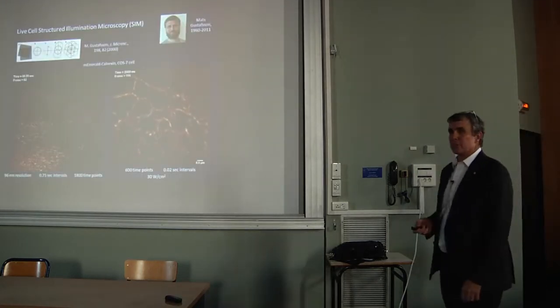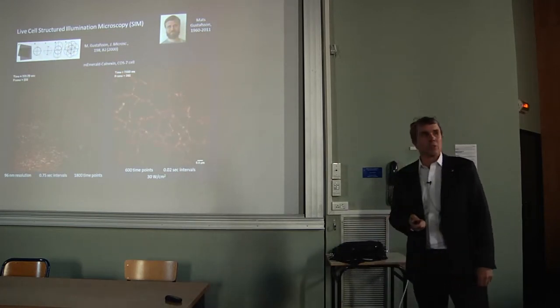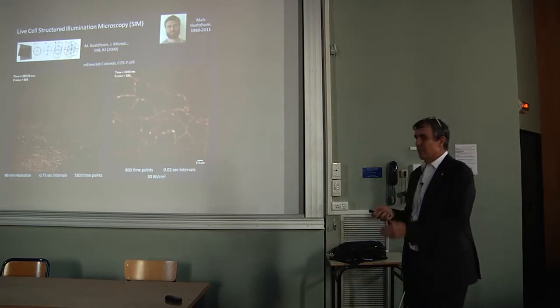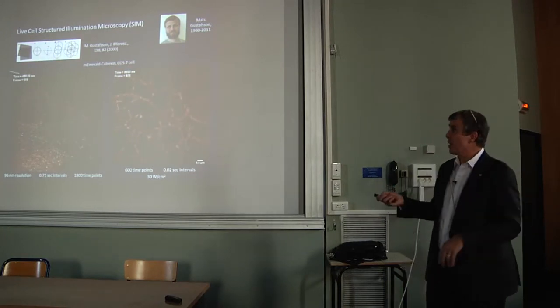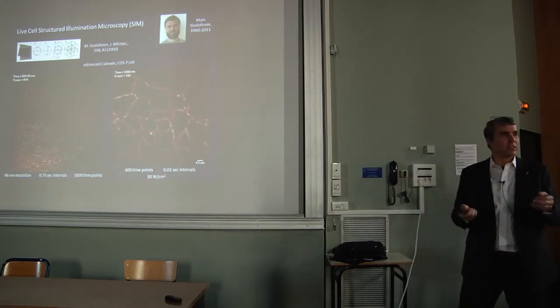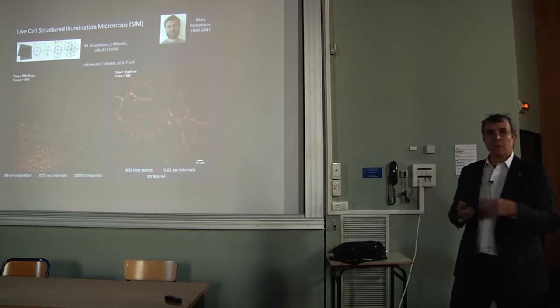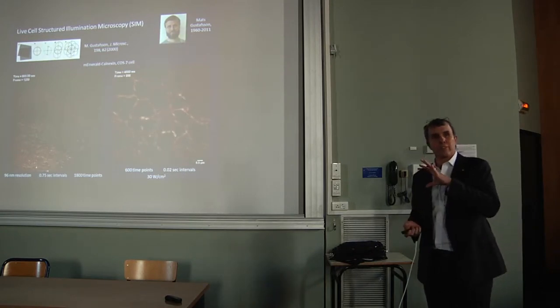So the one guy who appreciated those trade-offs before the rest of us was Mats Gustafsson, who was one of the pioneers of a different super resolution method called structured illumination microscopy. In this technique, it's a wide field method, not single molecule, in which you, instead of illuminating your sample uniformly, you illuminate it with a grating pattern, usually a standing wave that's created right at the edges of the diffraction limit. And then that standing wave beats against the different features inside of the sample to create low-frequency moire fringes, which are within the resolution limit of the microscope and hence detectable.